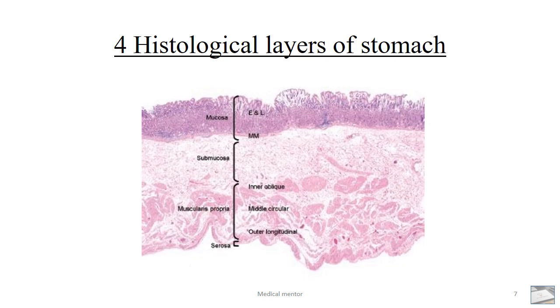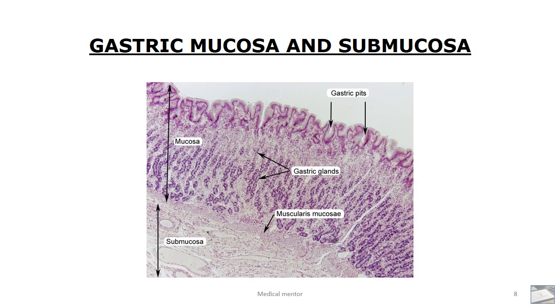This slide shows the four histological layers of the stomach and also shows the three layers of the muscularis propria — that is, the inner oblique, middle circular, and outer longitudinal layer. This slide also shows the gastric mucosa and submucosa. The mucosa is lined by tall columnar mucin-secreting epithelium with gastric pits or foveolae in between. The deeper gastric glands are also seen in the mucosal layer, lying just above the muscularis mucosa. Underneath the muscularis mucosa is submucosa that is rich in lymphatics, connective tissues, and blood vessels.